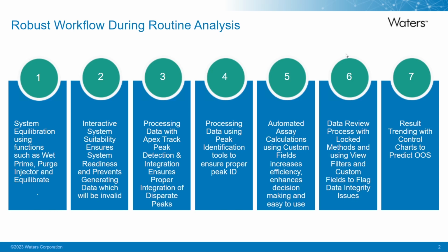System suitability is such an important topic, and it is one that could decide whether we continue with our run for the day or we stop if system suitability doesn't pass. So could we automate some of the system suitability checking, again, to make the workflow a little smoother for us and simplify that workflow?